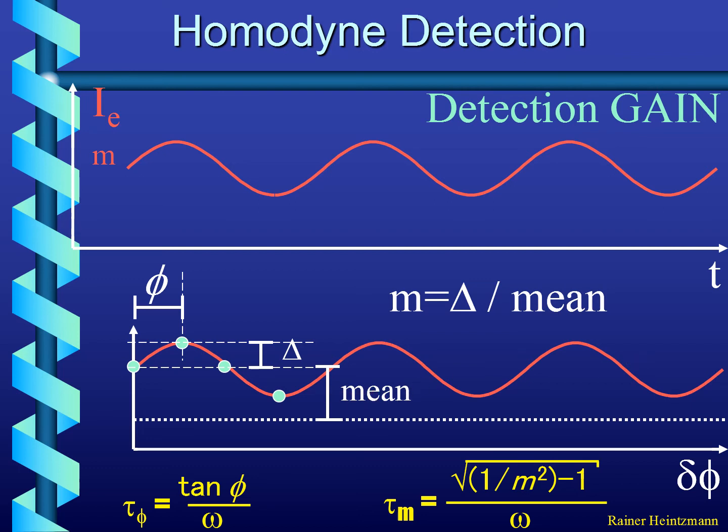It turns out if you assume a single mono-exponential decay, you can go through the math and you get these two equations here. This would be the phase modulated lifetime, and this would be the amplitude modulated lifetime, denoted with tau m for the modulation depth. You can calculate these two lifetimes from the modulation factor and the relative phase shift, and you would expect them to be the same if it is a mono-exponential decay.